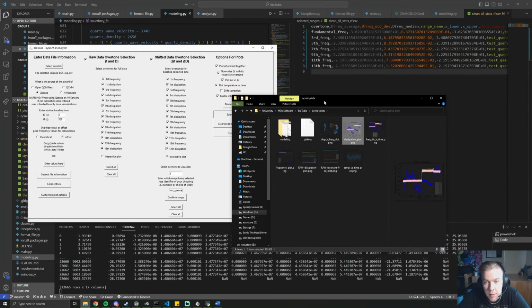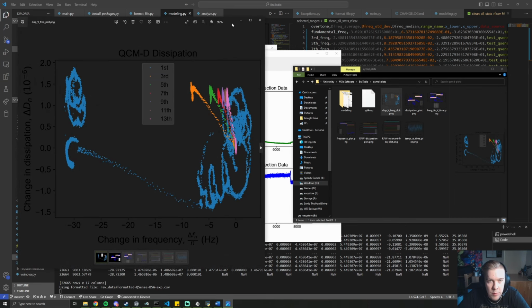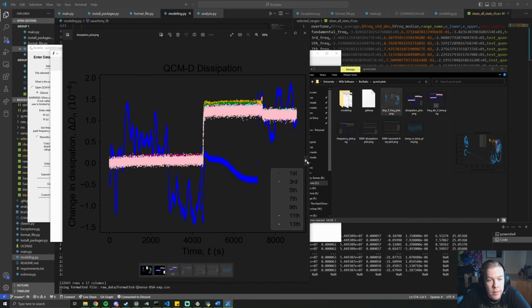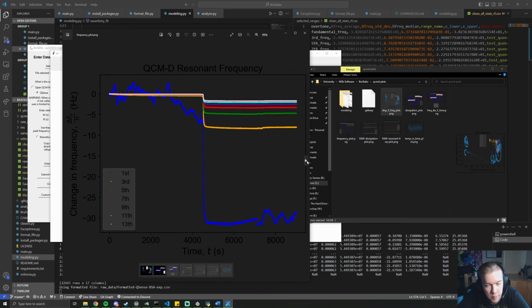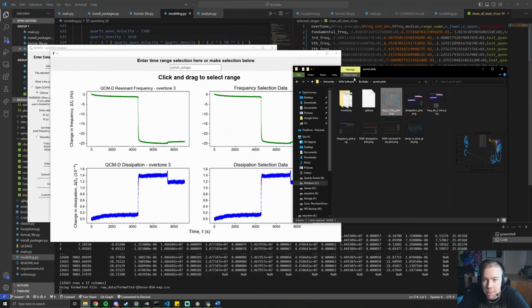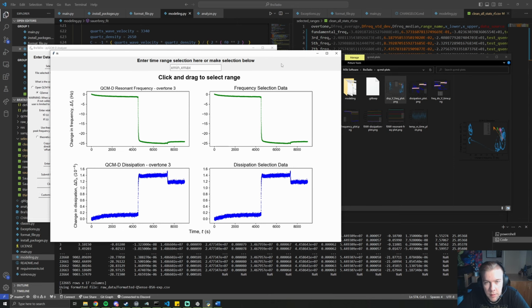Note that everything that was in the plot options folder, not the modeling folder, but in the main folder, will get overwritten. So everything here you're going to see is just for the QSense experiment, not the QCM-I one we analyzed previously. This has a pretty noisy fundamental frequency, but I did include it just for posterity's sake, but everything else here will behave the same. You can also experiment with the modeling functions on the QSense file.